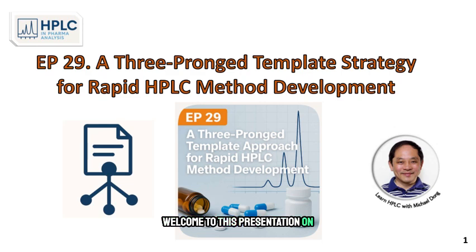Welcome to this presentation on a simplified, template-driven strategy for rapid HPLC method development in pharmaceutical analysis. Research shows that people learn new processes more effectively when following a template. Today, we will introduce 3 HPLC method templates that represent the major quality control methods for small molecule drugs.